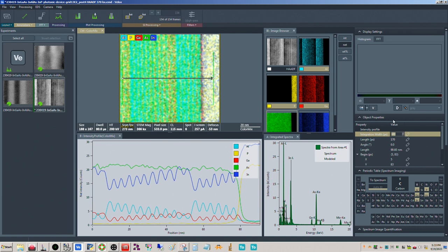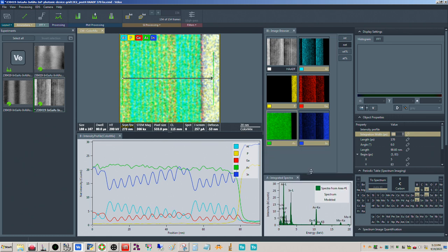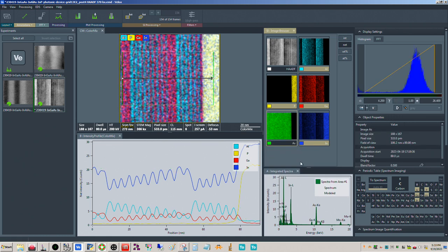So, all right. As always, if you have questions, please let me know. You saw some of the issues with this. Sometimes things don't go perfectly smoothly. We did run out of drift with that atomic resolution one, which is not uncommon, especially when you're at a scale that fine. The drift correction becomes pretty critical at that point. So let me go ahead here. Yeah, if we turn off the arsenic, then it shows it much better.